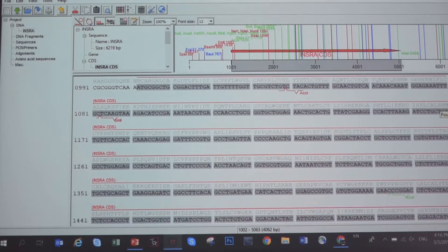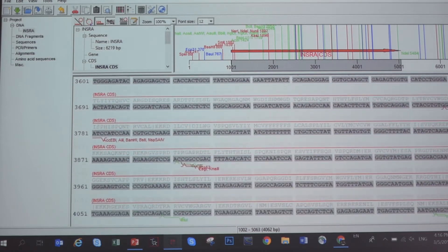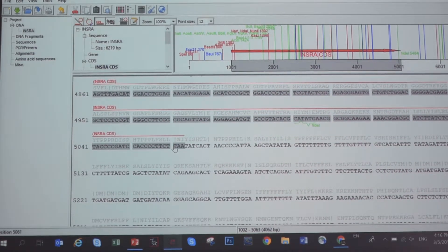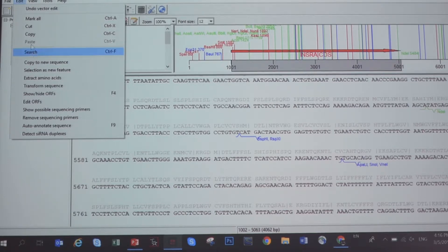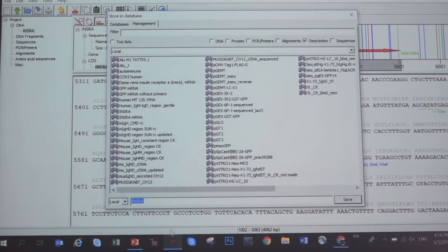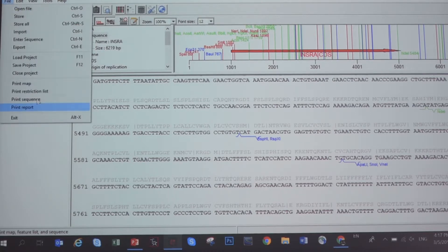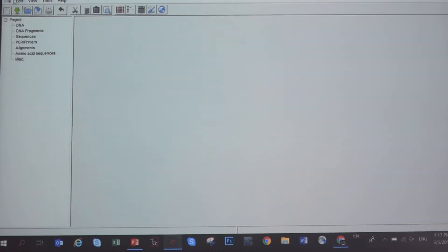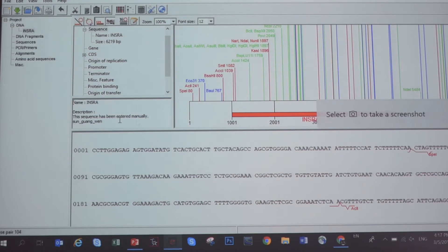In the sequence panel below you will see the changes — the red line indicates the coding region. Once you've made the changes, click 'Store' and overwrite your regular sequence. Once done, close the project and re-open it — a simple trick. Then you'll see that the sequence is very clean.